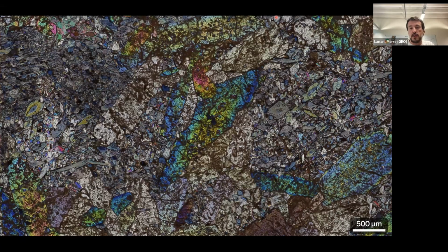When I look at metamorphic rocks, this is an example from Greece. This is a blueschist from Greece. Just on the optical image, you can already see big minerals, small minerals, different colors, probably corresponding to different compositions. Those rocks are quite complex to study because from this optical image, you cannot get as much information as what you would like.